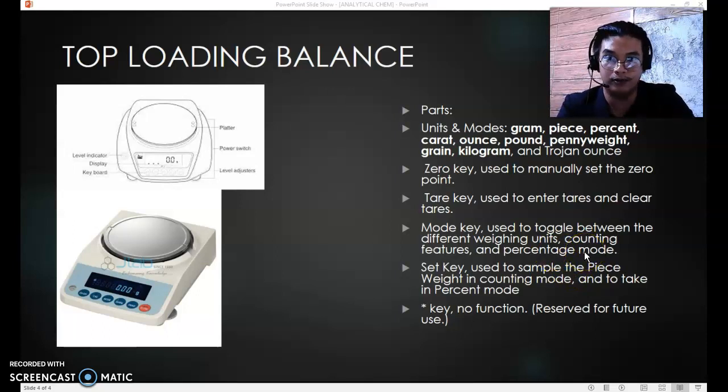Set key is used to sample the piece weight in counting mode and to take in percent mode. The star key has no function and is reserved for future use.